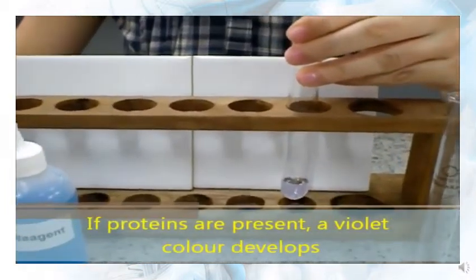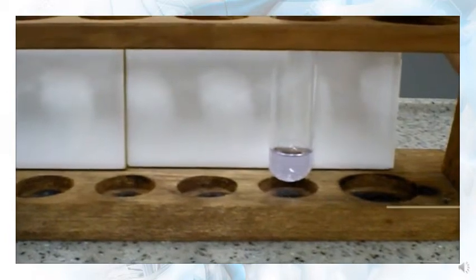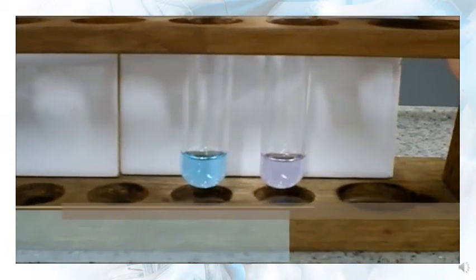If proteins are present, a violet color develops. If proteins are absent, the solution remains blue.